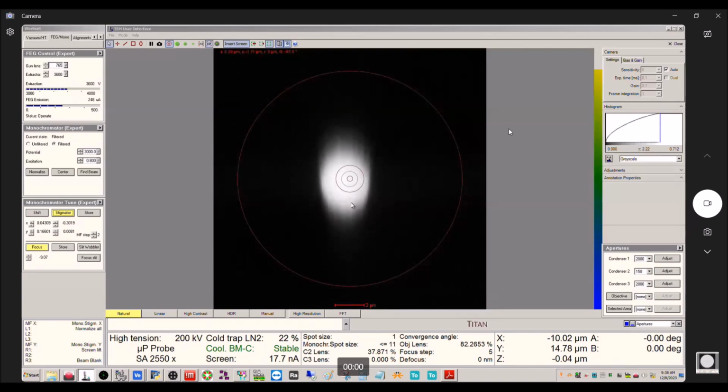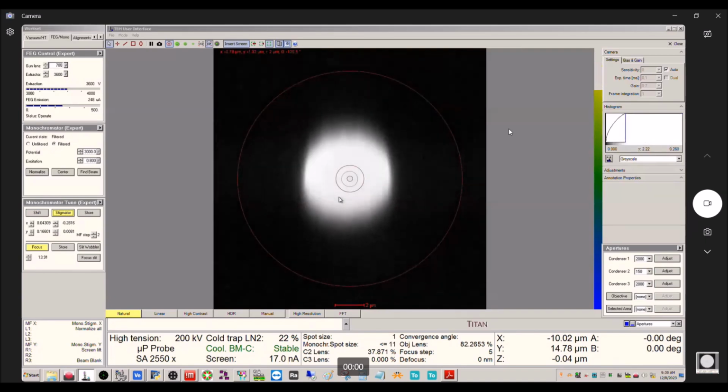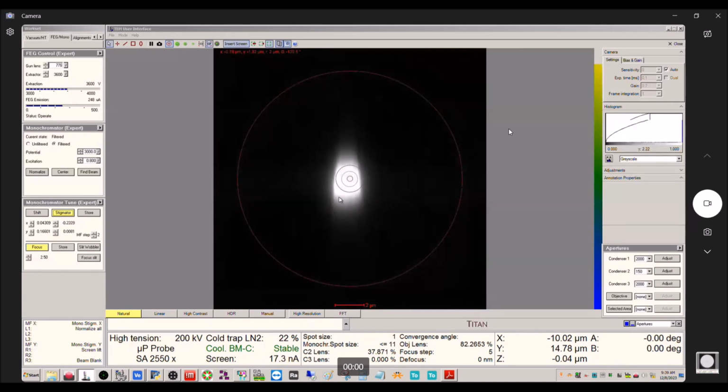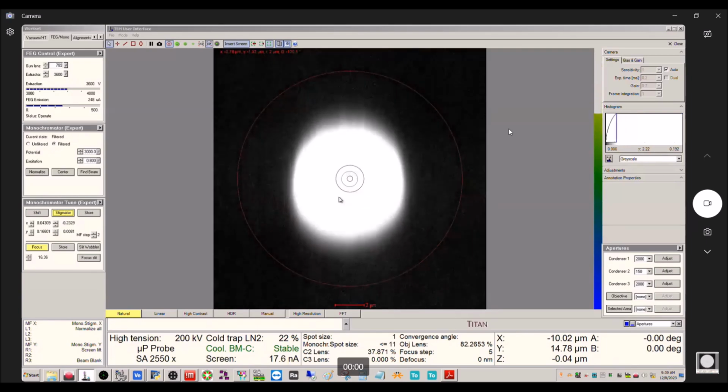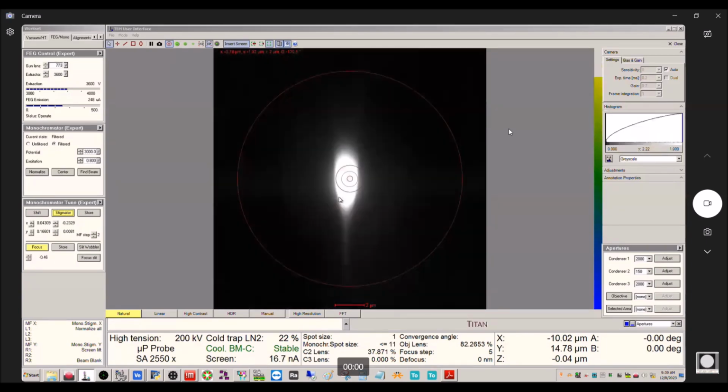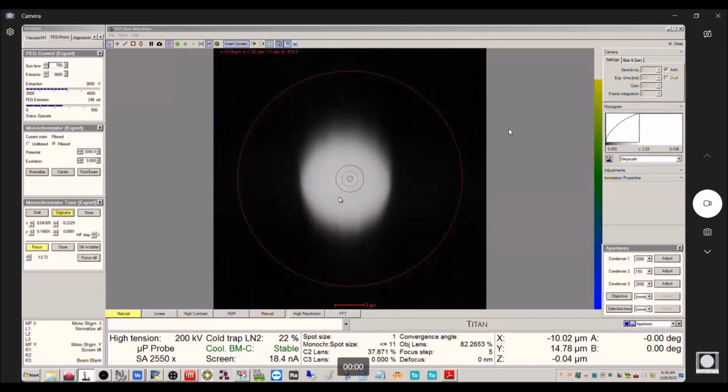We're trying to get this shape in the middle to be like a circle. This is where it was. It was elliptical. So we can adjust this until it's roughly a circle. Okay, that's better than how it was. That looks pretty good right there. I think that's probably about as good as we could expect with this.